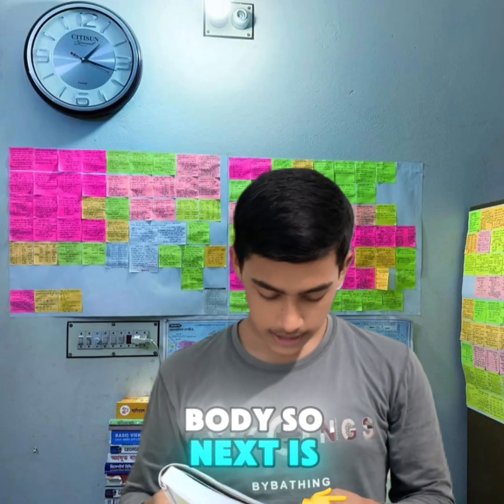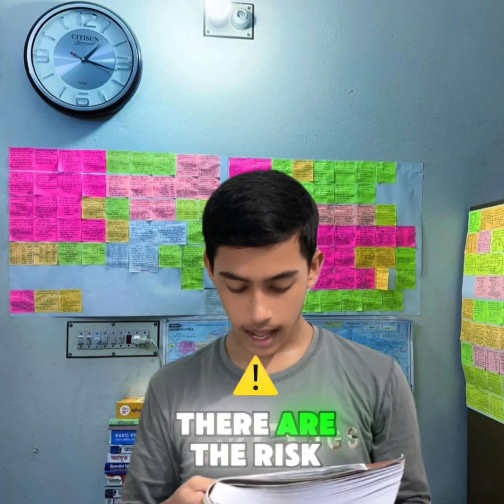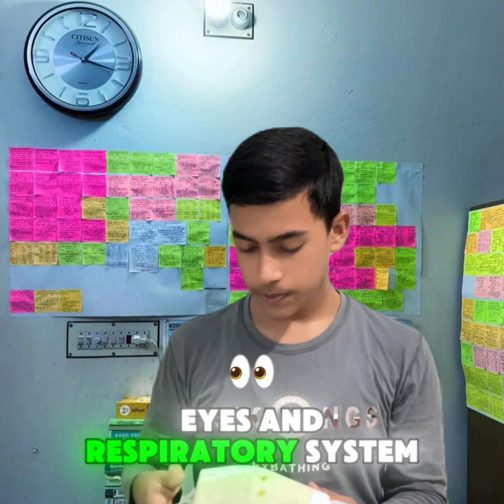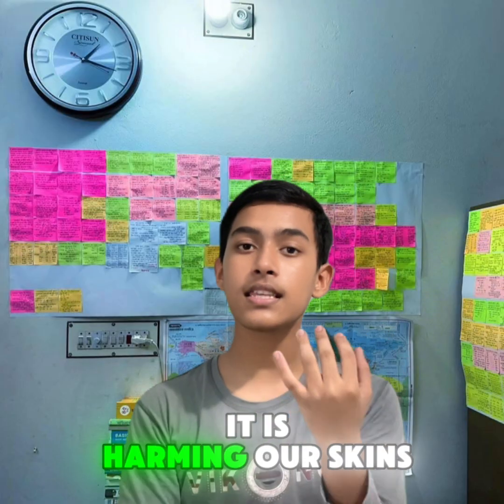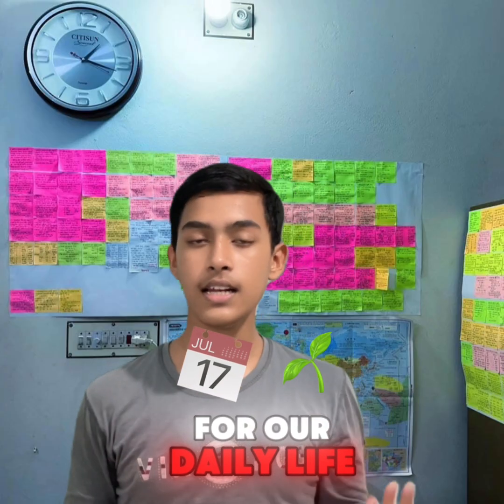So next is irritant substances. The risk of irritant substances is that they can damage the skin, eyes, and respiratory system. If these touch our body, they can cause huge damage, because they harm our skin and eyes, which are most important for our daily life.